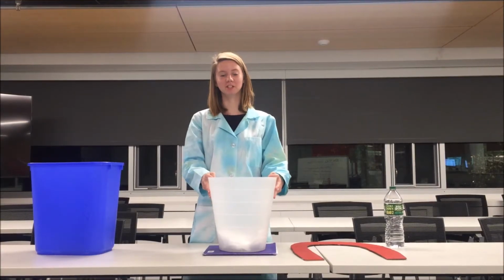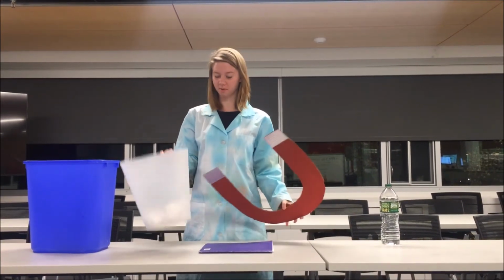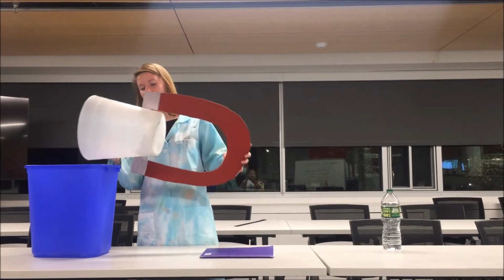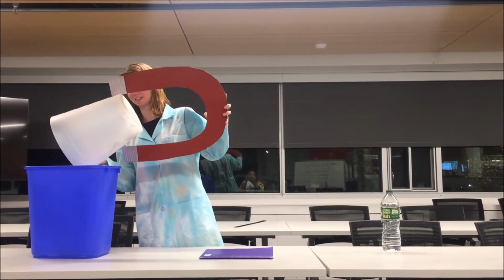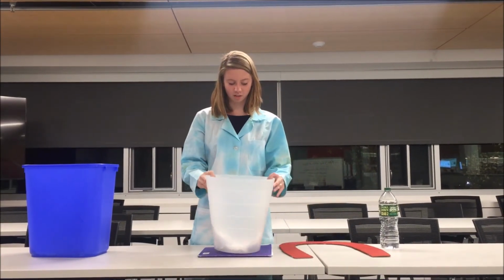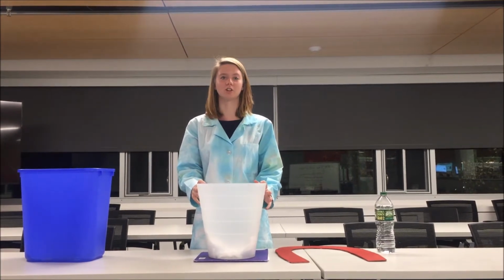After 30 minutes, we took the beaker off the hot plate and used a magnet to draw the nanoparticles to the bottom. We then poured out the excess ammonia into a waste beaker, with the nanoparticles still at the bottom. The nanoparticles appear white here, but they were actually a dark brown, blackish color.